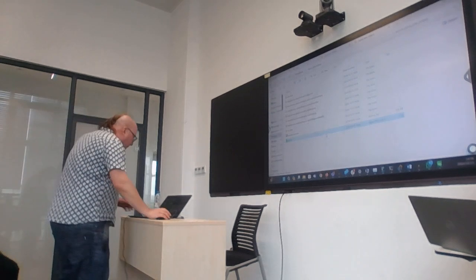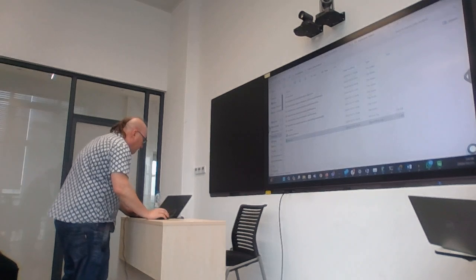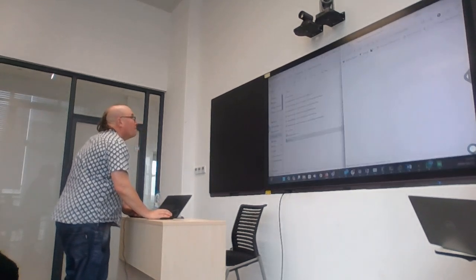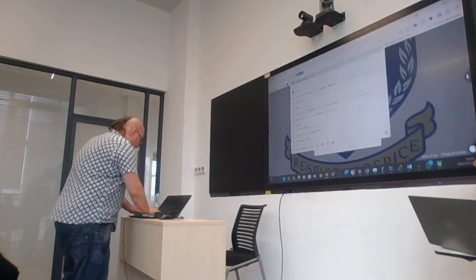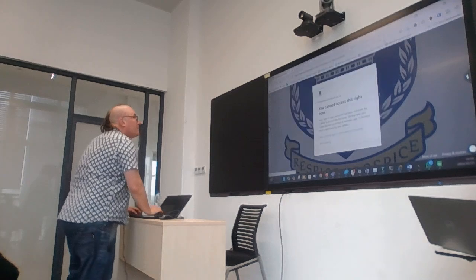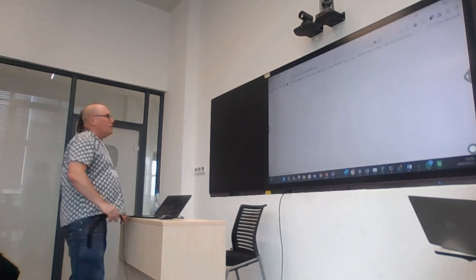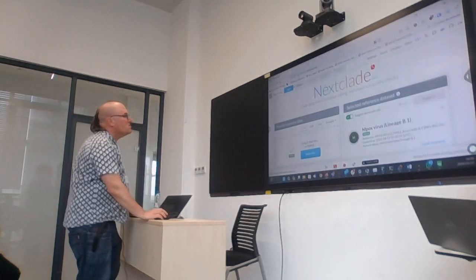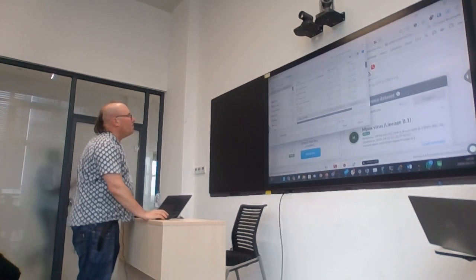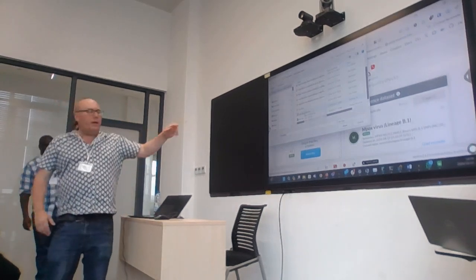So if I go to my web browser, and I look for Nextclade, then here's the Nextclade website, clades on nextclade.org, and I can take the output file from my Mpox1 output, the all consensus file, okay?